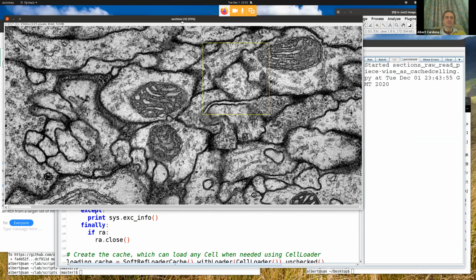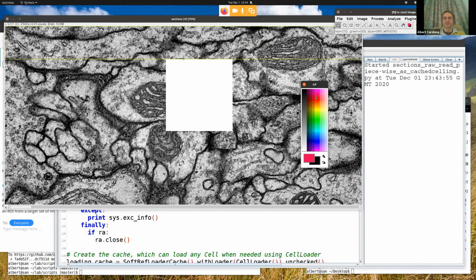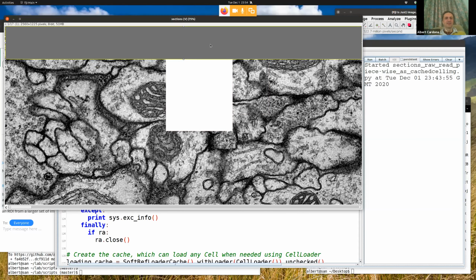Basically, if I come here and I draw this, if we were to read this cell, it means you first offset all the way, all of this you need to offset plus all of this needs to be offset. Let me choose a different color, like say red. Of course, that's a gray image. All of that needs to be skipped, and I need to reach the beginning of this white rectangle. And then I need to read one line of this white rectangle, and then skip the whole width again, which is the distance from this point to the next point here for the next line, and the next line, the next line. And so I will read this white line by line.